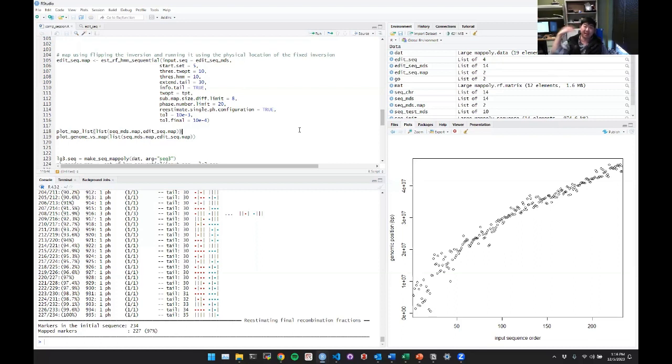And they just had to pick one way. And it just happened to be inverted differently than what is biologically true. So in my experience, if we map through that using the regular genome order, it's good enough to pick up QTL, good enough to do any genetic studies. It will map through and keep those markers.